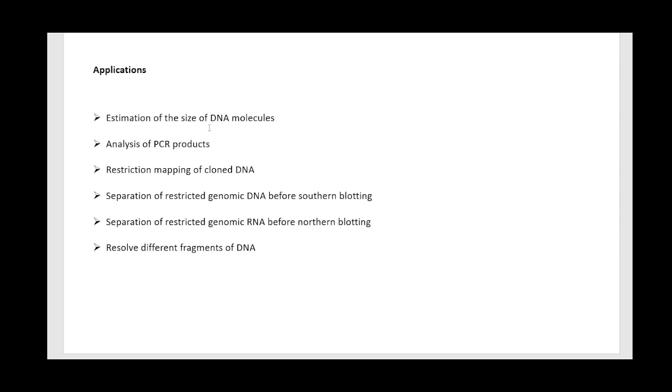Let's see its applications. This is useful in estimating the size of DNA molecules and analyze PCR products. It is useful in restriction mapping of cloned DNA and separation of restricted genomic DNA before performing southern blotting, and separation of restricted genomic RNA before performing northern blotting. It is useful in resolving different fragments of DNA.